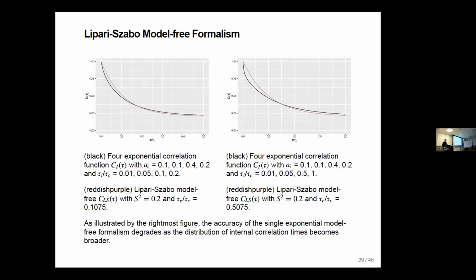And of course, if motions get slow enough, then we start to pick them up in relaxation dispersion experiments, but there's a missing window, and year by year, people try to narrow that window. That window is motions slower than the tumbling time, but faster than, say, 10 microseconds, or let's say 1 microsecond to be optimistic, which is where solution relaxation dispersion experiments start to get really difficult. So you have a factor of say 100 missing.